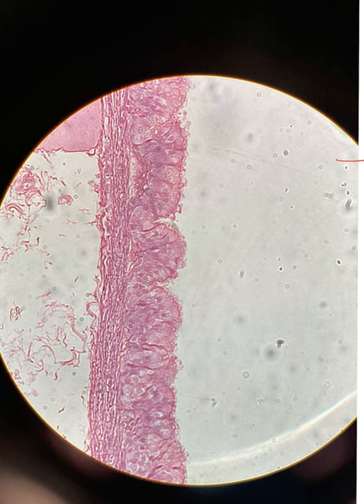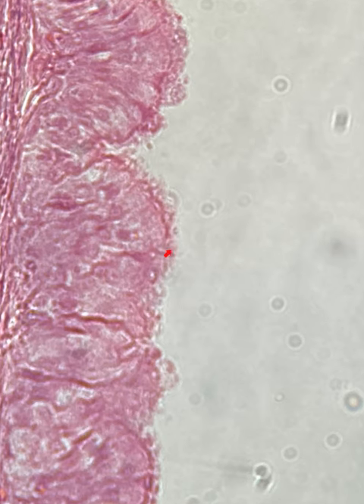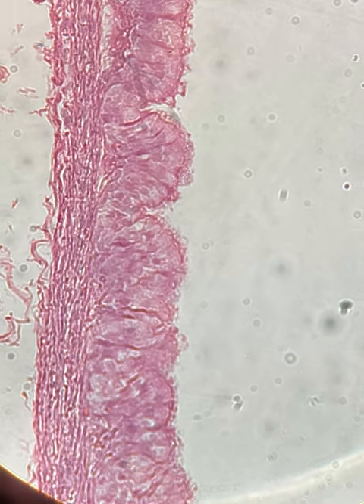One giveaway that this is not multiple layers of cells, that it's not actually stratified, is that it's all sort of like one layer. And then you can see, let me zoom in, these little tiny hair-like projections, these are cilia. And they're really helpful for propelling things along, right? So a place that you're going to find pseudostratified ciliated columnar is going to be in the respiratory tract, where these cells are responsible for secretion and propulsion. And the propulsion is moving, so think about it, it's like mucus, right?